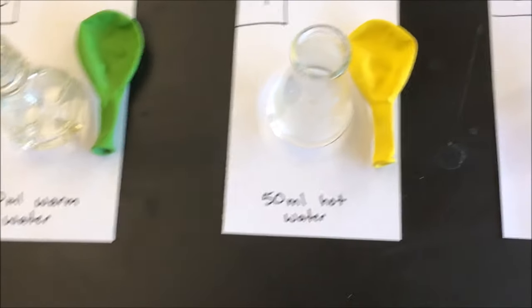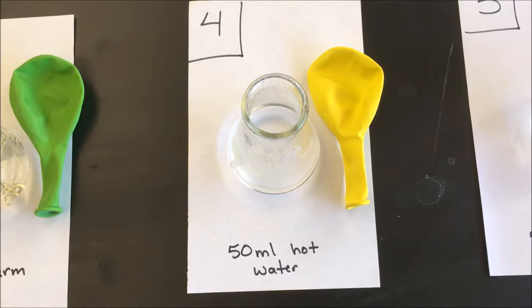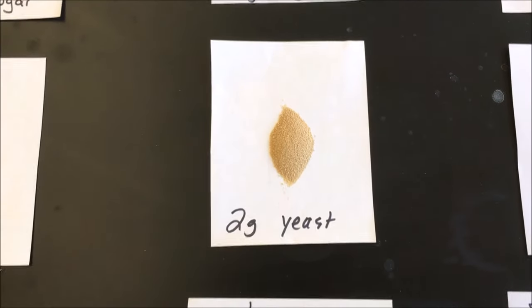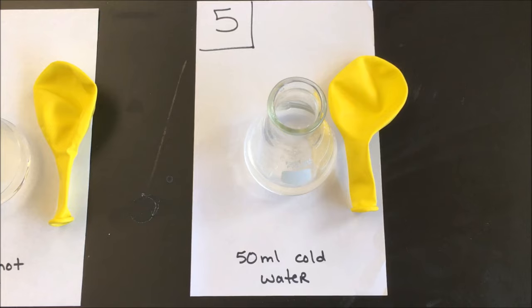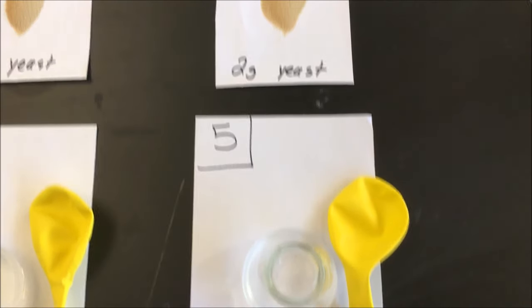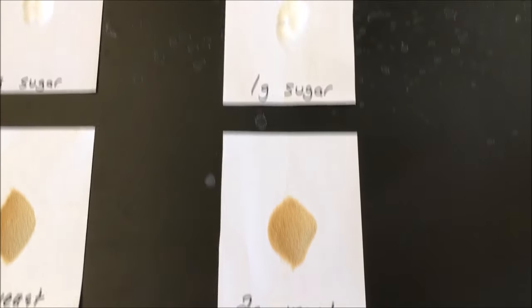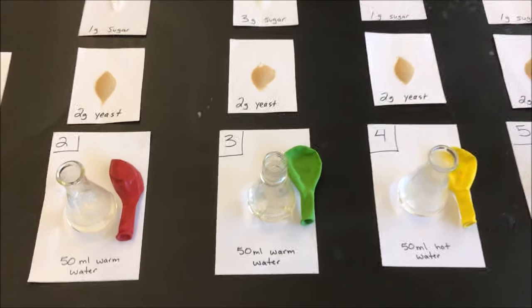Flask number four has 50 milliliters of really hot, boiling hot water, two grams of yeast, and one gram of sugar — mix it all up. Flask number five has 50 milliliters of cold water — there are still ice crystals in it, that's how cold it is — along with two grams of yeast and one gram of sugar.